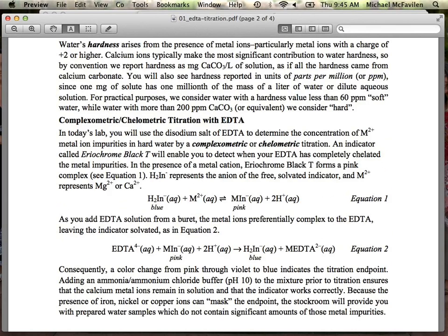Your first trial through, do a little bit faster than you would the others. And when you get close to within probably 5 mLs of your endpoint, start adding it much, much slower, giving it a good little bit of time to mix evenly, so that way you can get the appropriate endpoint without overshooting it too far, okay? Questions about any of that so far?